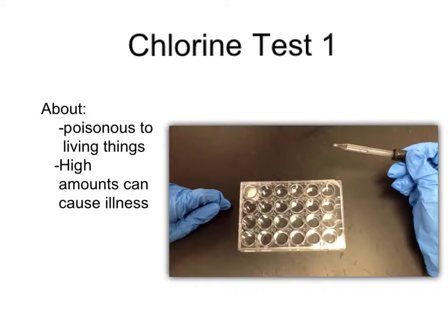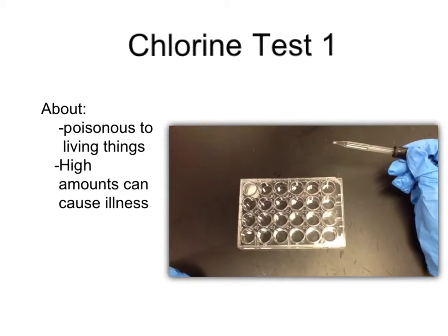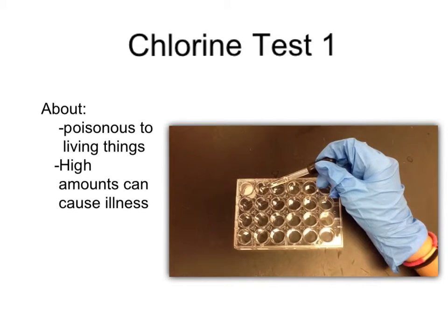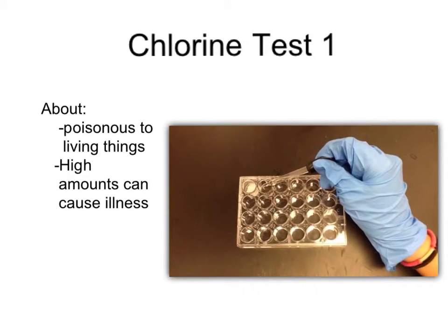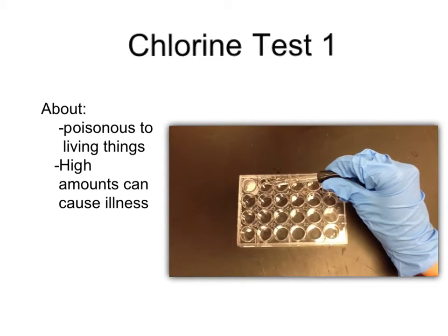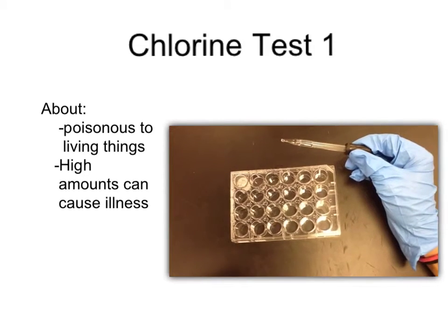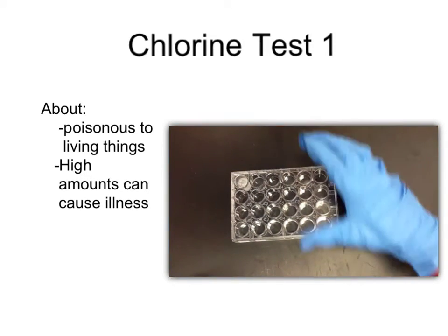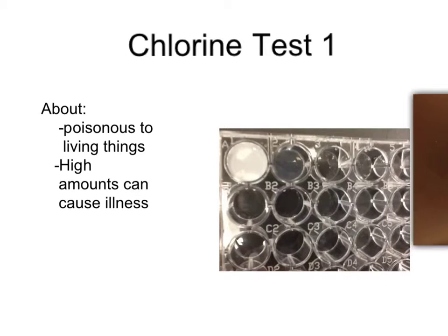In this test we will be testing chlorine. This is the control for chlorine. In this one we are going to add 20 drops of lake water to test. Then when we add the testing solution, there is very little precipitate, but you can see it a little bit. Here is a close up so you can see.